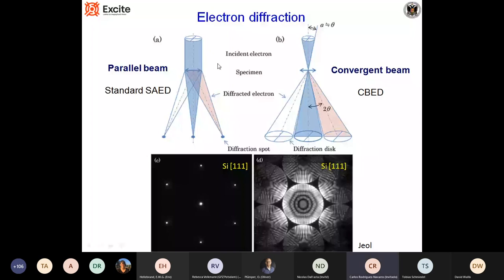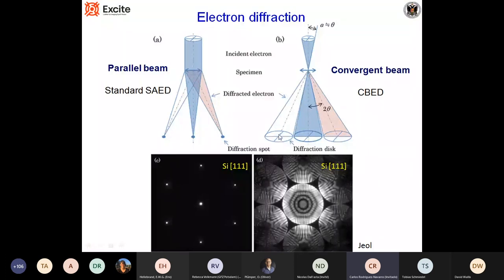Going back to the basics of diffraction in the TEM: with a parallel beam interacting with the specimen, it will produce diffracted beams going in different directions from the direct beam, producing a characteristic pattern. This is for the zone axis 1-1-1 of silicon. If we have a convergent beam, diffraction will lead to the formation of different cones that hit the detector and produce CBED images, whereas in parallel beam selected area electron diffraction, what we have are spots.